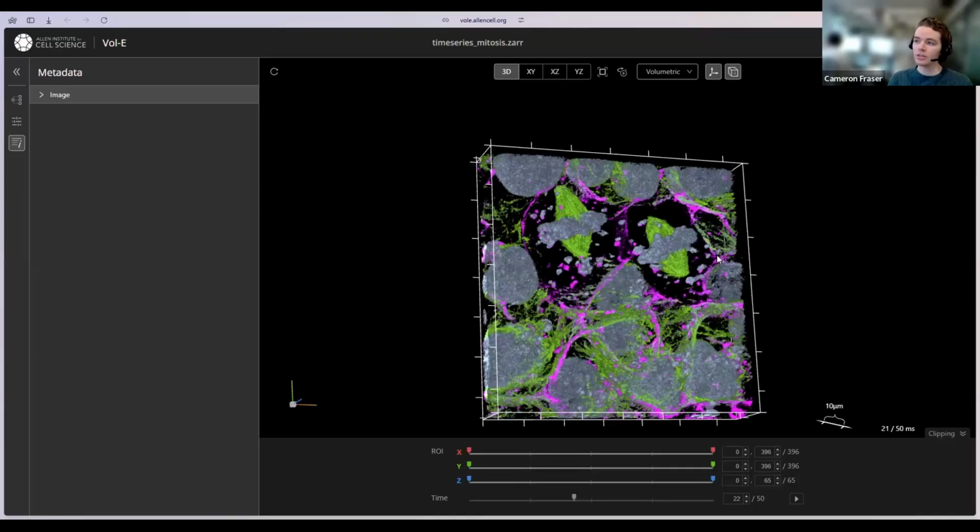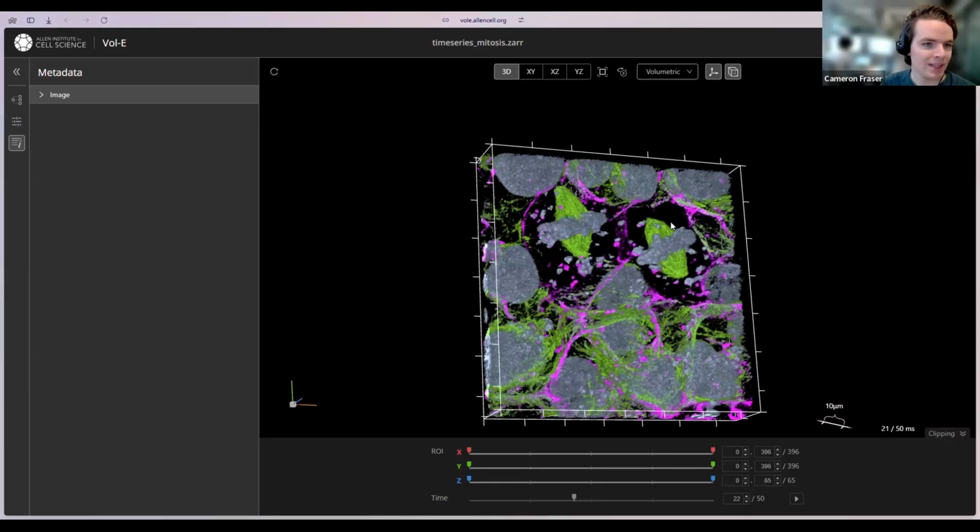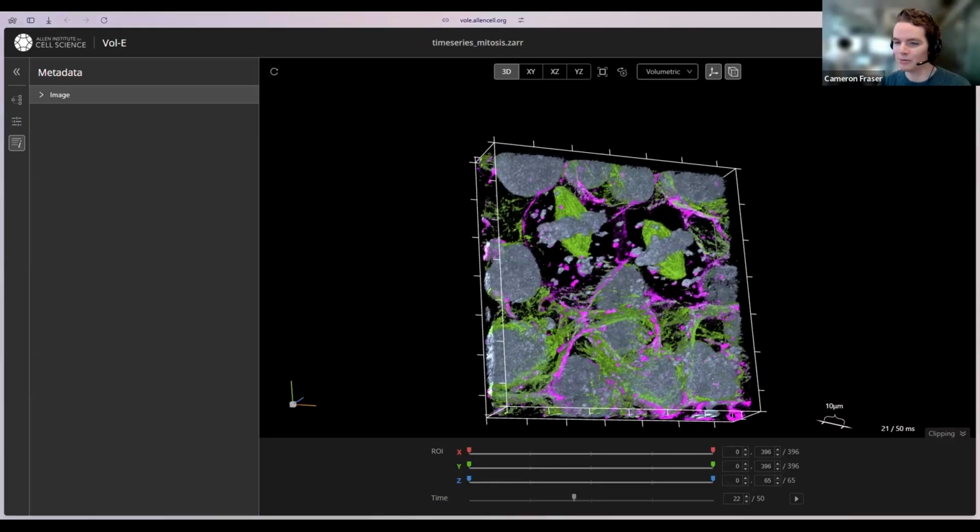downsampled from the original, or how much memory you're willing to let your browser take up. We are currently a little bit conservative. Again, we're giving people controls over that sort of thing, and once those controls are in, you'll be able to do kind of whatever you want with your own computer's memory.